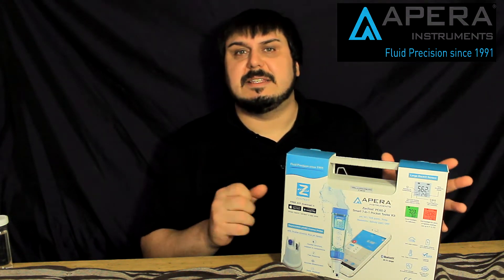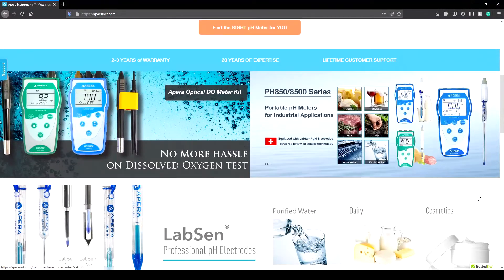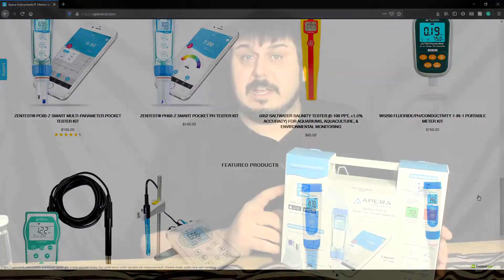Hey everyone, I'm Mike and today we're taking a look at the Apera PC60Z. This comes from Apera Instruments, who have been known for almost 30 years making high quality lab grade precision testing equipment. I'm very happy to be able to talk about this product today.